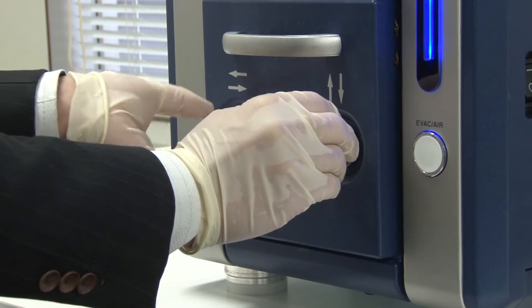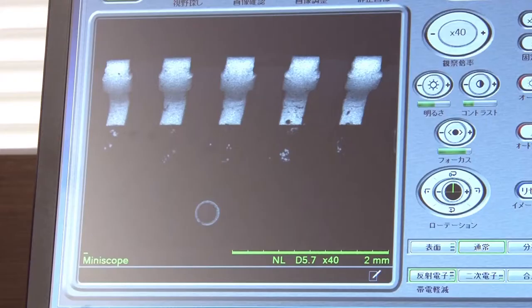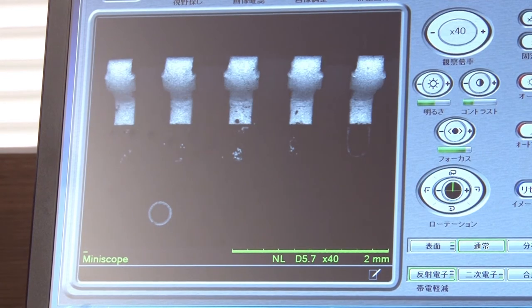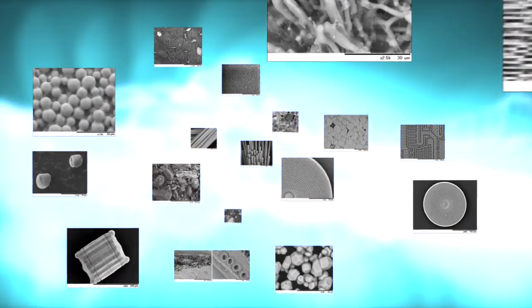As well as supplying this product for research and development and quality control in a wide range of fields, including semiconductors, material science, and biosciences, Hitachi High Technologies will keep supporting the needs of schools, science museums, and other educational institutions.